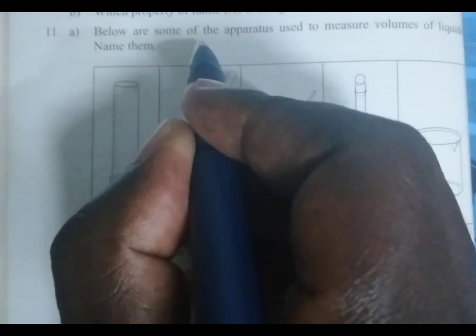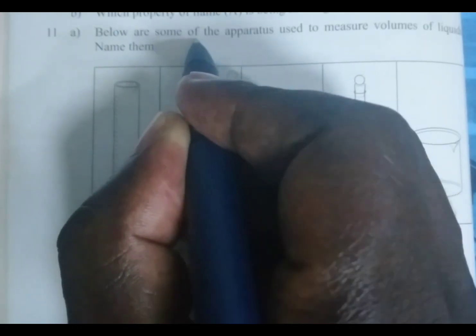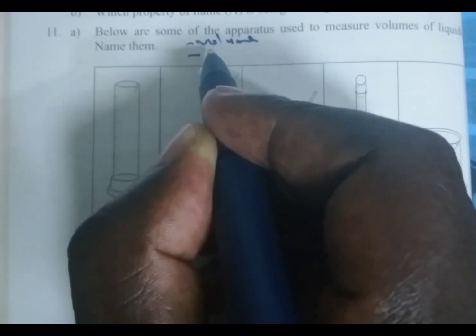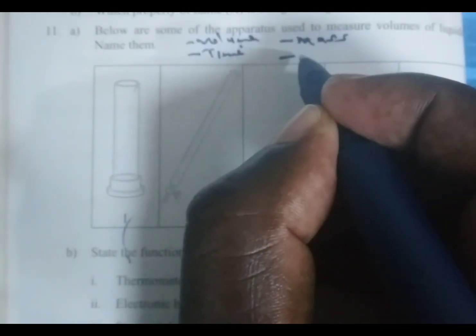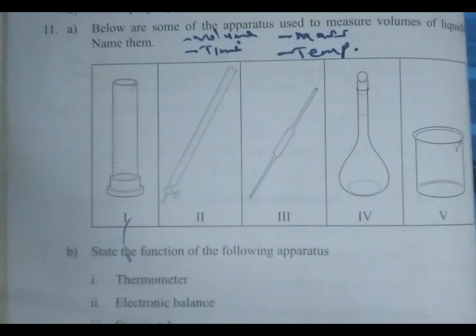One, we have those apparatus which are used to measure volume. We have those apparatus that are used to measure time. We have the apparatus used to measure the mass. We also have those that are used to measure temperature.